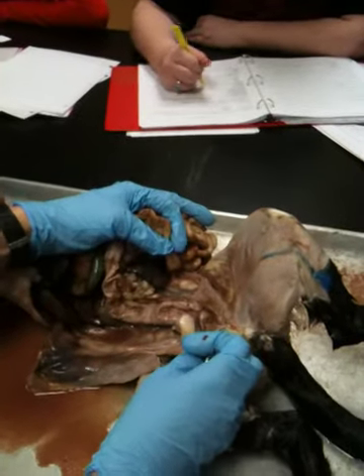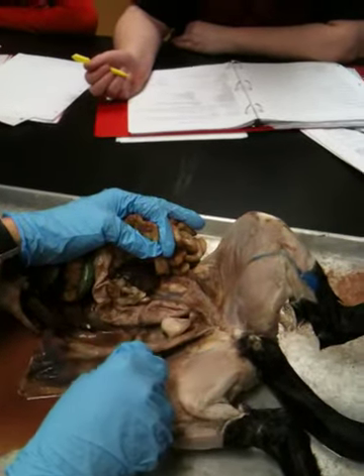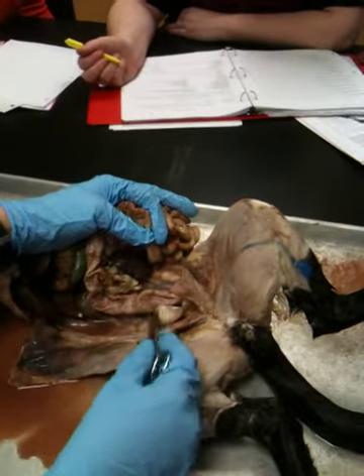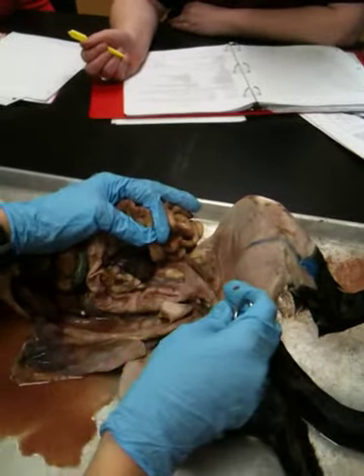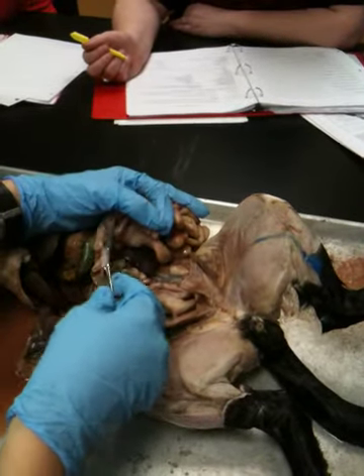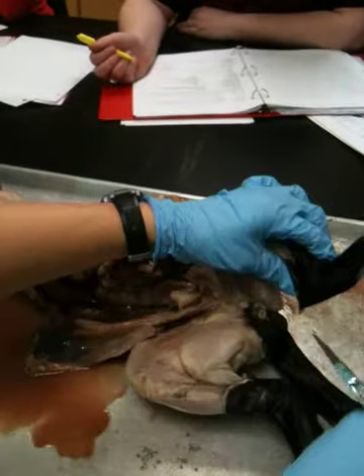And what's unique about this compared to us is we would have another, it would be much more clearly defined. On here it's descending and then rectum, and it's kind of guesswork on where the junction point is. But on us, we will have another segment of colon called the sigmoid. They do not have that in the cat. So you're missing a segment. So we have ascending, transverse, descending, rectum, and then if I tag anus, I tag it from this end.